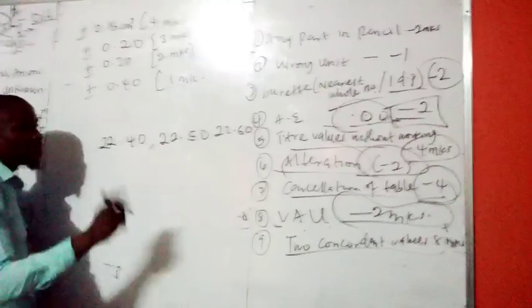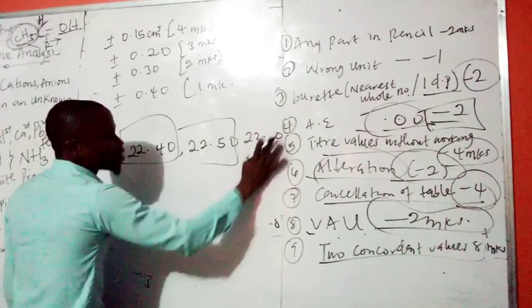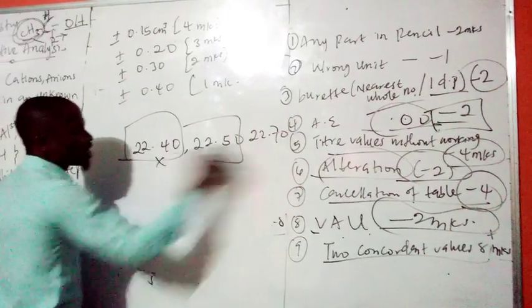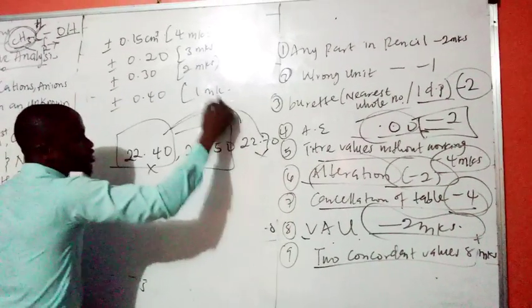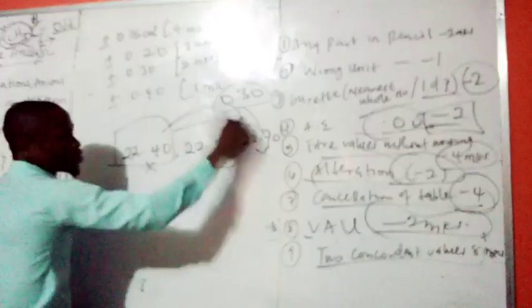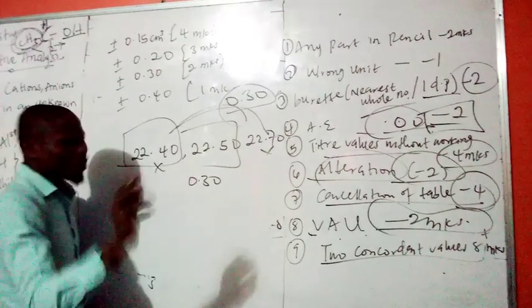If you are picking two titer values, you can either pick this and this, do you understand, or this is 22.70. If you are picking this and this, they are not concordant. This is because the difference between these two figures is 0.30. So, if you are having difference of 0.30, there are no more concordant.